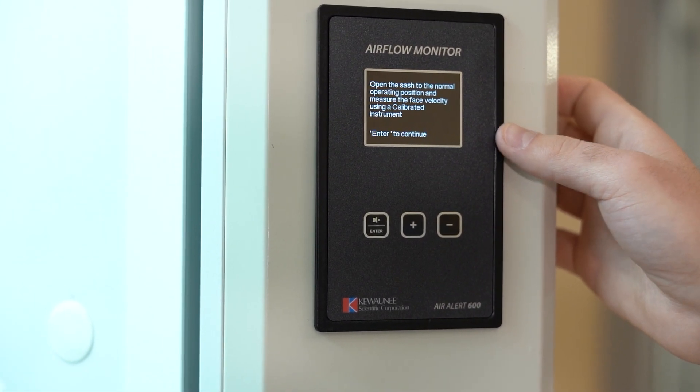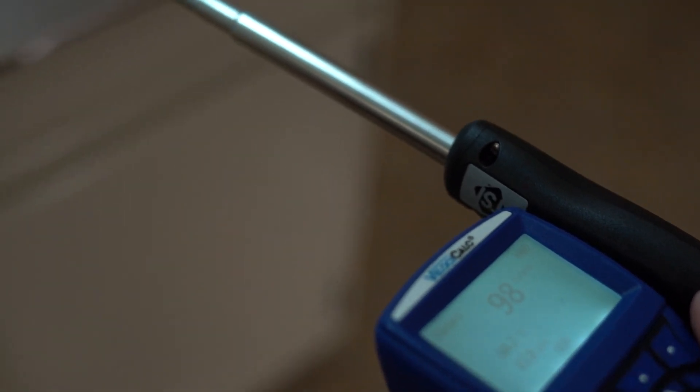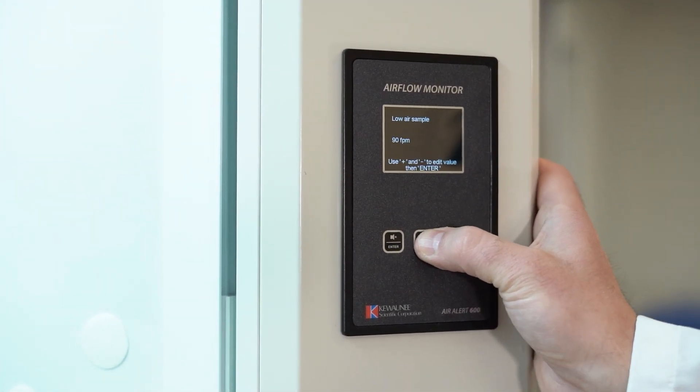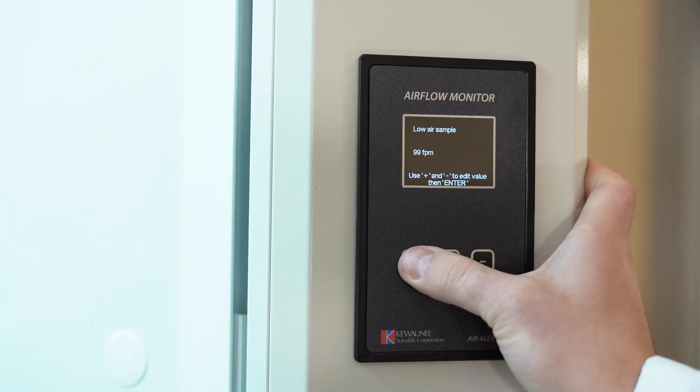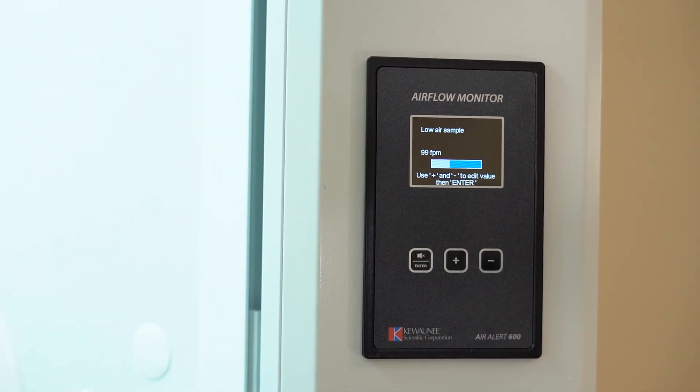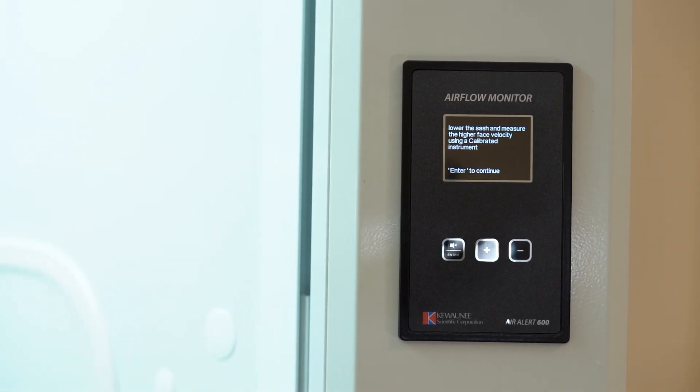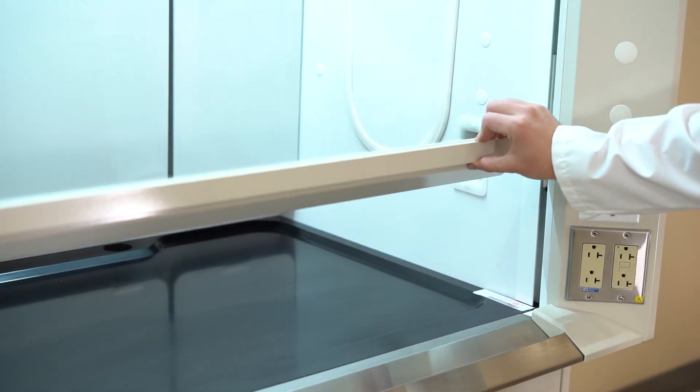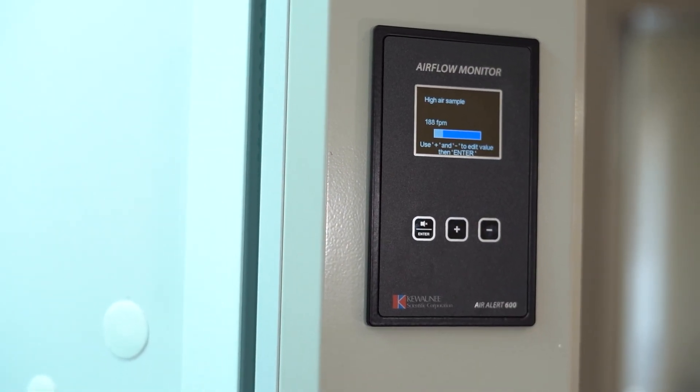You will measure the face velocity with the sash at normal operating position. The monitor will load that information, then ask you to measure the face velocity with the sash at a lower position. After entering that information, the calibration is complete.